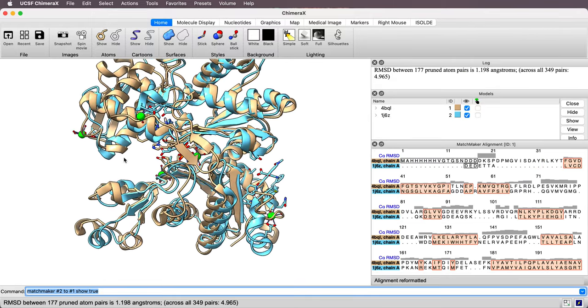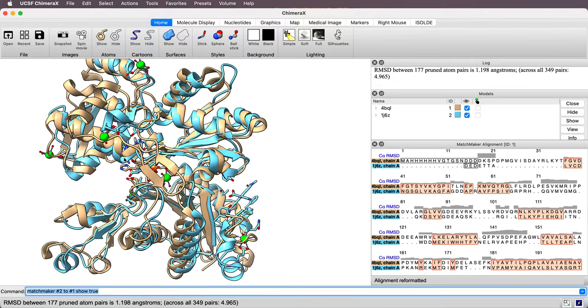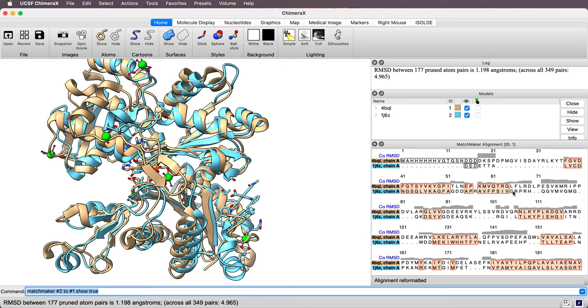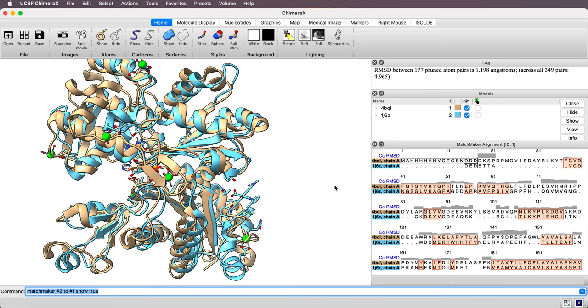So let's do that. So now they're aligned. And the sequence alignment appeared over here on the right. These two proteins had quite different sequences. And so a sequence alignment was made. And then the corresponding C-alpha atoms, the second model, the rabbit one, was rotated and translated to align the C-alpha atoms as well as possible to minimize the root mean squared deviation between the C-alpha positions.